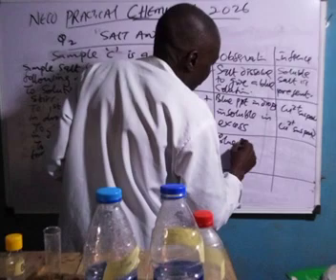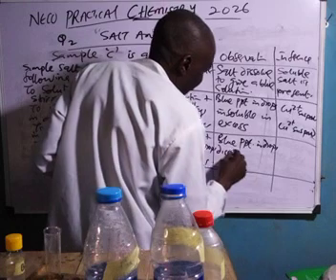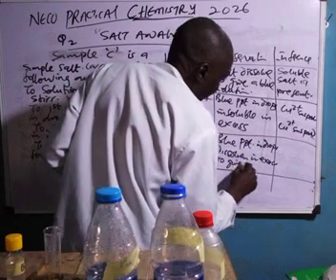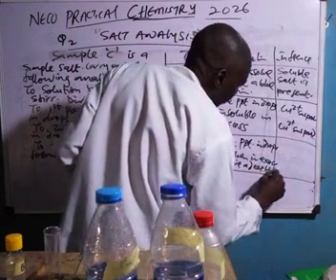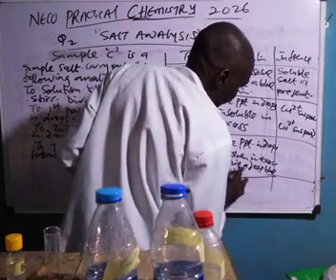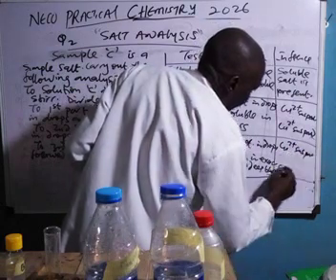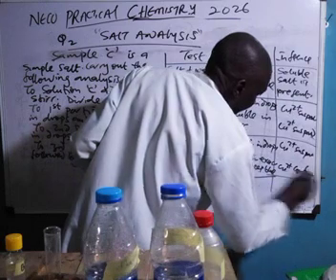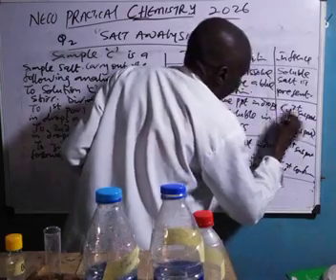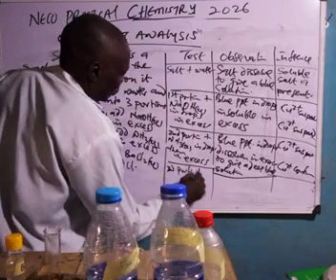Observation: blue precipitate in drops, dissolves in excess to give a deep blue solution. Inference: Cu2+ suspected, Cu2+ confirmed.